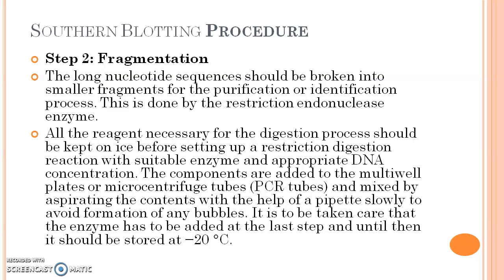This is done by the restriction endonuclease enzyme. All the reagents necessary for the digestion process should be kept on ice before setting up a restriction digestion reaction with suitable enzyme and appropriate DNA concentration.